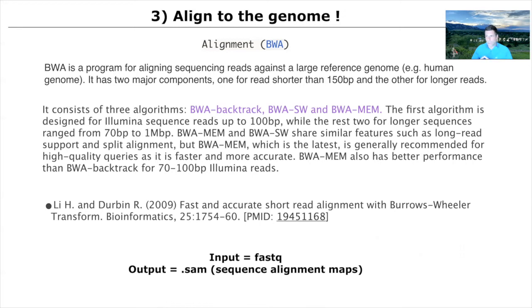And so the Burrows-Wheeler alignment is worth lots of studying. I think it could deserve a whole class in and of itself. I'm just going to give you a high-level conceptual aspect of it. There are 3 different versions that Nextflow will run depending on the read length and whether it's paired end. And for other applications such as RNA-seq, you might be using different versions of this, but Nextflow will know what to put in each pipeline. The inputs are these FASTQ files, which are the raw sequence reads that now have the adapters trimmed off so they can be aligned to the genome.